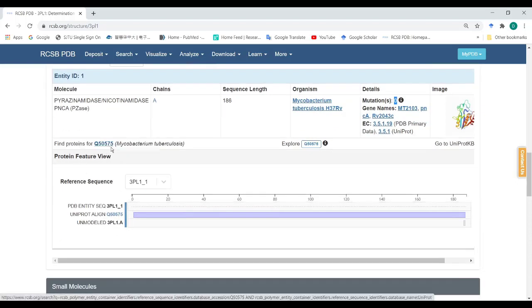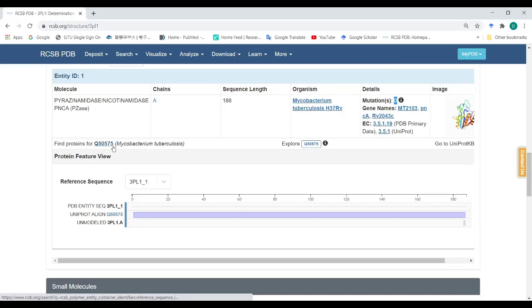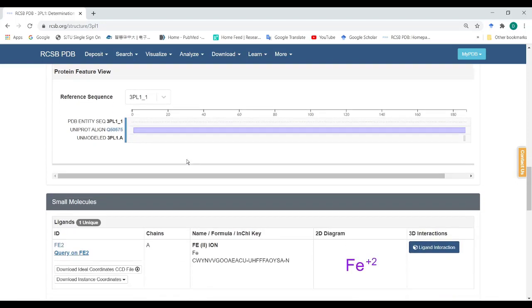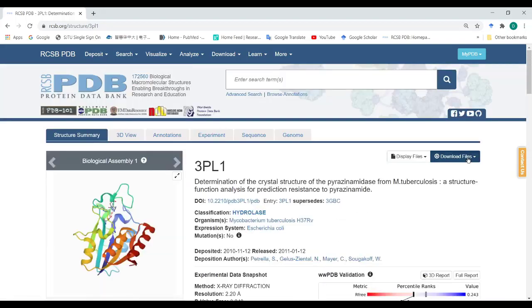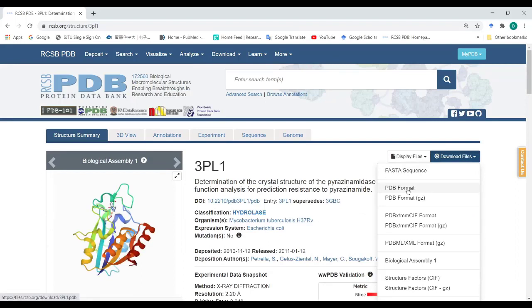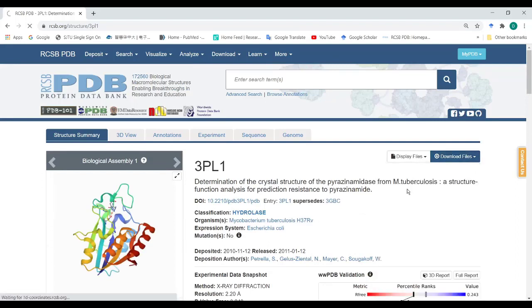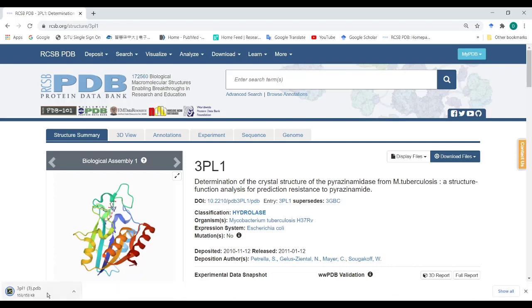This is the UniProt ID of this protein. If you want to download the sequence, use this UniProt ID. This is the small molecule present in this protein, which is the Fe ion. Scroll up and download the structure from here in PDB format — the structure is now ready to open.